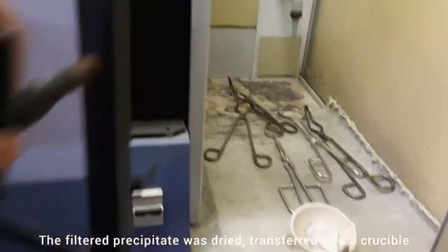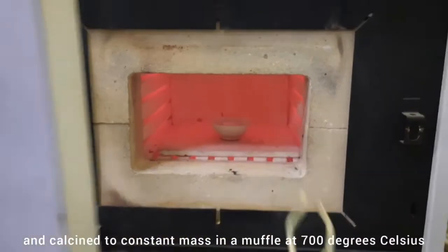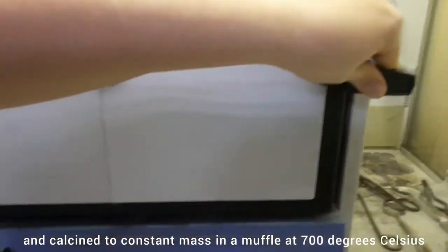The filtered precipitate was dried, transferred into a crucible and calcinated to constant mass in a muffle at 700 degrees Celsius.